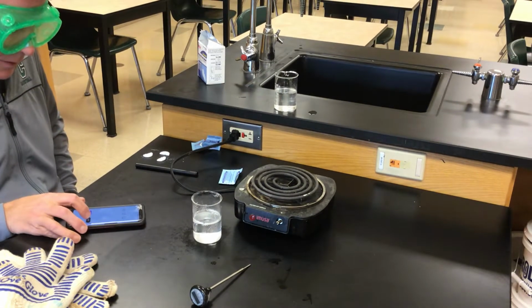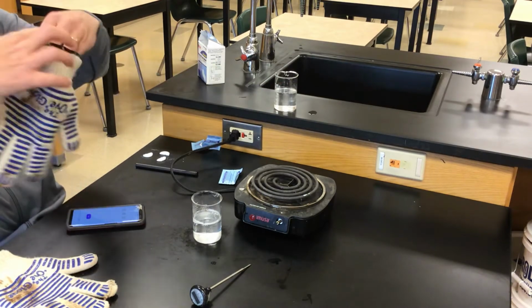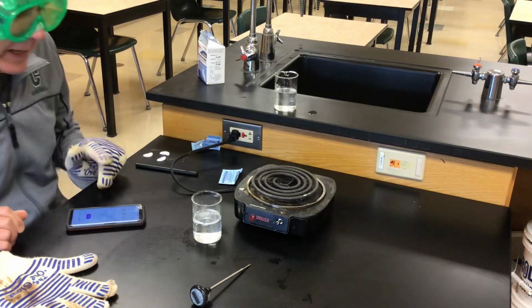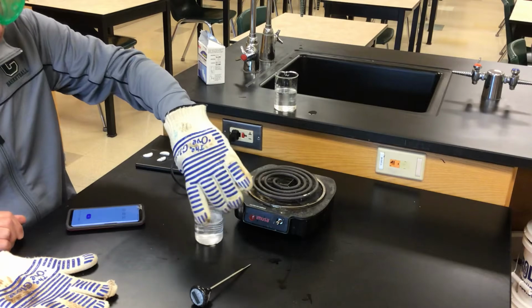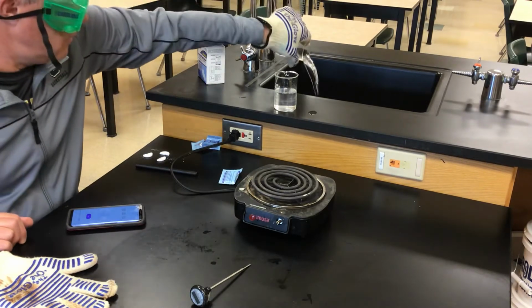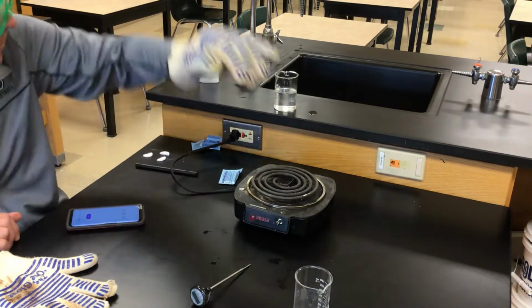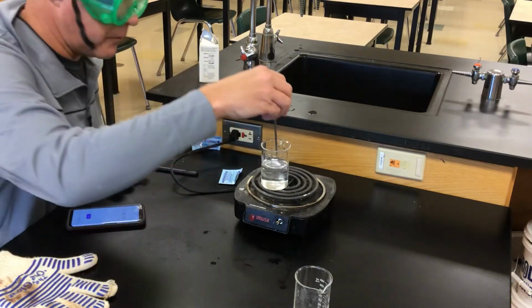21.53. So now what we'll do is we'll take the second beaker of water, and this is the point at which you should ask yourself, should we empty that out or just redo it? I'll let you think about that question a minute while I'm dumping it out. Think about why we wouldn't use the same water again. I'm going to see what the temperature of this bad boy is in a minute.